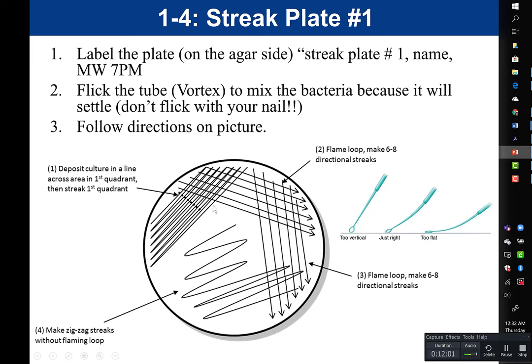Once you put your bacteria on the first quadrant, remember the goal is to get less bacteria in each quadrant. To achieve this, flame your loop and let it cool. While it cools, rotate your plate 90 degrees so that quadrant one is now to the side, and then after your loop has cooled, you can do your 6 to 8 directional streaks.